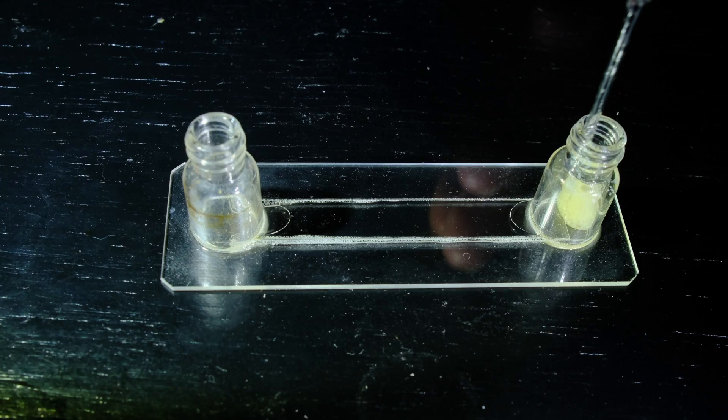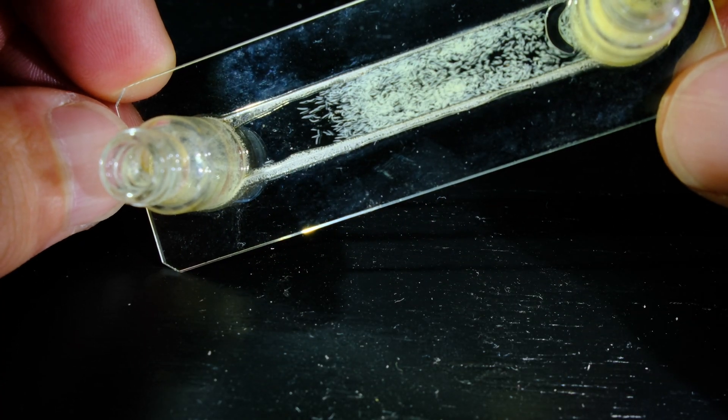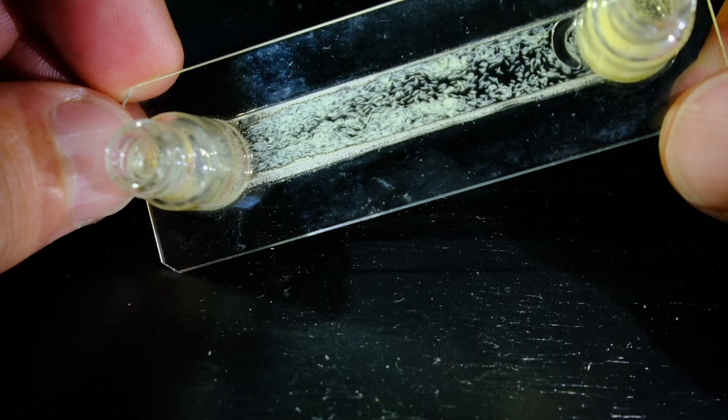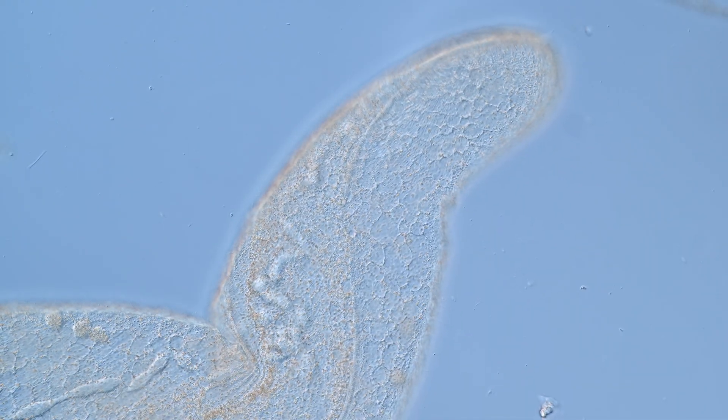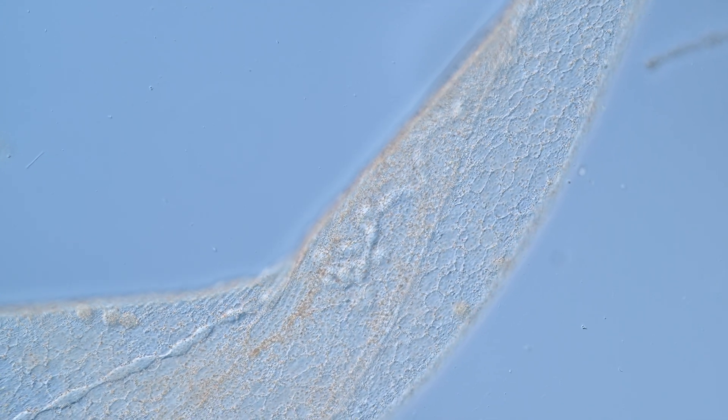Let's load up the slide with some microbes and see what happens. The microbe we will be using today is spirostomum, a massive unicellular organism equipped with a protomuscle. Please check out my detailed video on these microbes if you want to know more about them. This is a swarm of spirostomum under the microscope at low magnification, swimming peacefully under normal conditions.